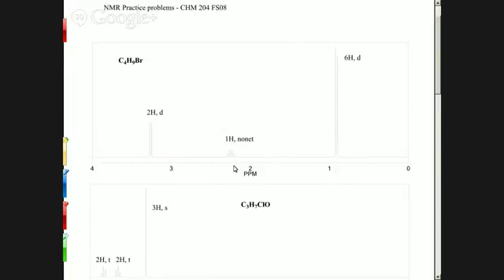That should be for the single peak, and this peak should be over here. I don't know why it ends up low. So the question is where would the double bond show up? We're only looking at hydrogen atoms, so we don't see anything else. It would be these hydrogens over here. Well, this is CH3.